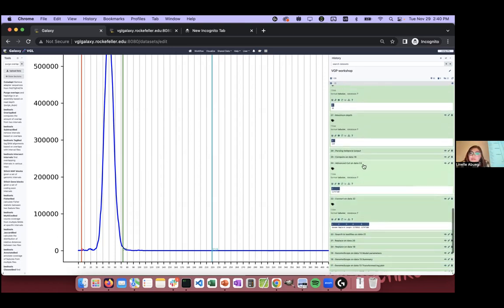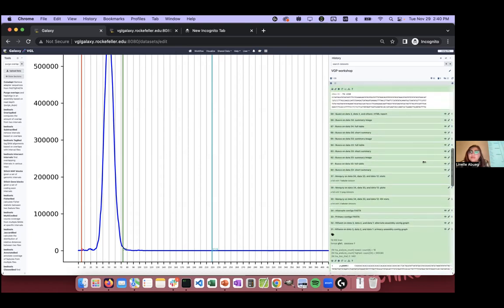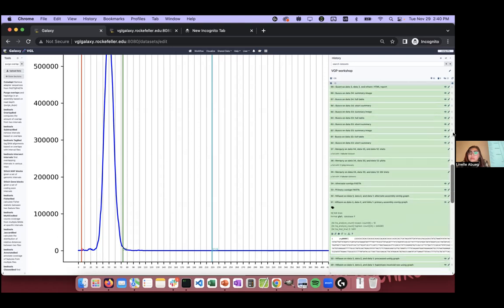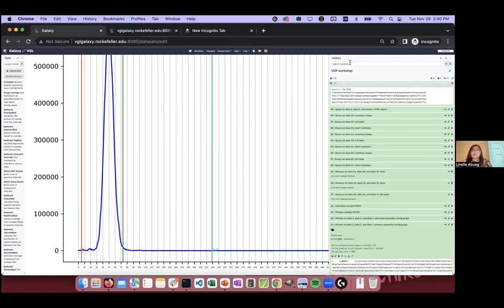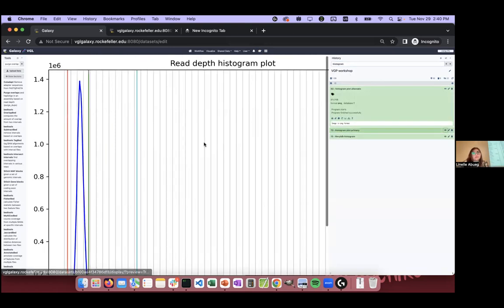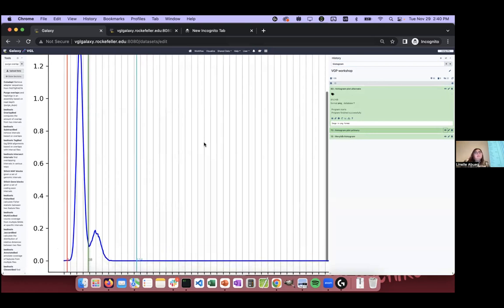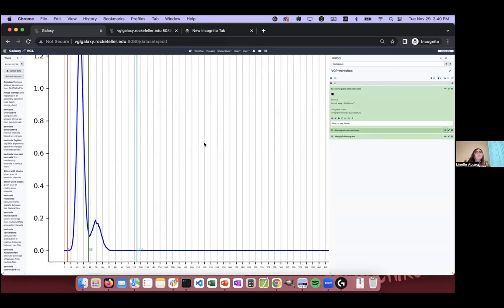Now we would ideally like to represent both haplotypes, the primary and the alternate haplotype, as complete as possible. In this case, we usually only represent the regions of the other haplotype that really diverge, so not the homozygous parts. I see, so the output is much smaller.